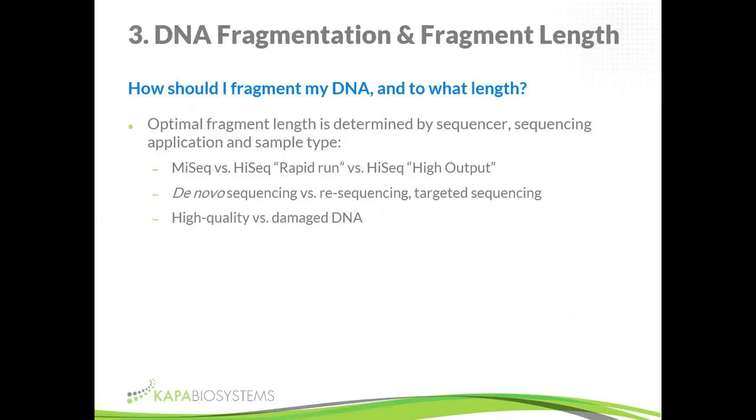So for de novo, typically, if you have no scaffold, if you have nothing to align your sequence to, and you have to build it from scratch, the longer the better, remembering that there are limitations in terms of cluster amplification and sequencing chemistry. But also for de novo sequencing, where you're building sequences without any help, having well-defined or narrow size distributions is more valuable. Especially with microbes, it's very easy to get very, very high coverage, because in a lot of cases, if you have cultured samples rather than environmental samples, DNA input's not limiting, and so you can start library construction with as much as you can get, and then reduce size selection. During the size selection process, you lose a lot, but it definitely has advantages for what comes later.